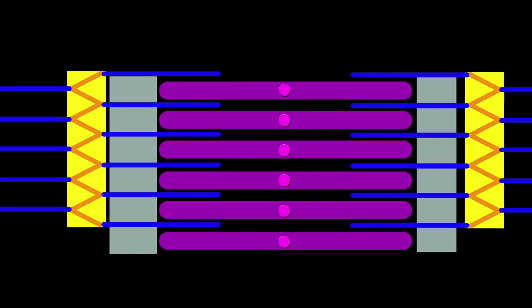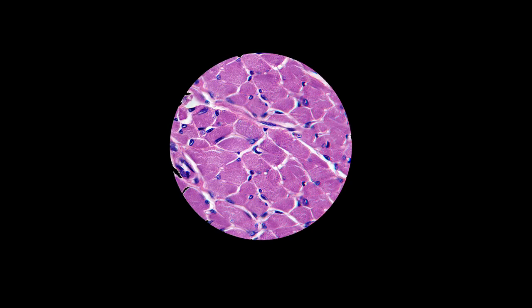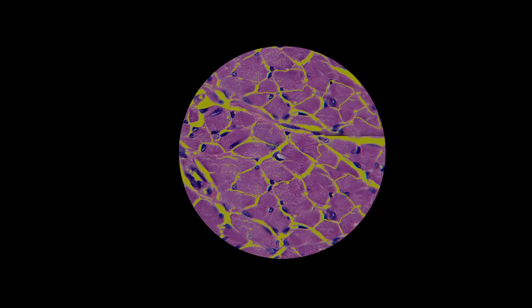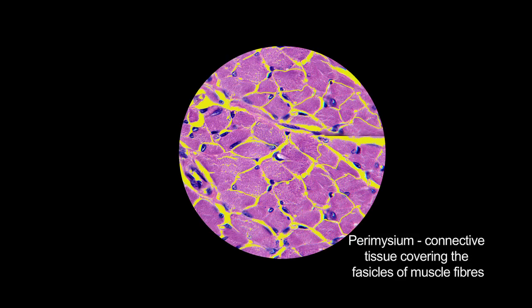Now let us look at the cross-section of skeletal muscle. This is a cross-section of muscle fibres grouped into fascicles. The nuclei, stained dark blue with hematoxylin, are peripherally located within the muscle cell. These fascicles are in turn surrounded by connective tissue called the perimysium. Most muscles are made up of several fasciculi, and the whole muscle mass is invested in the epimysium, a connective tissue sheath.